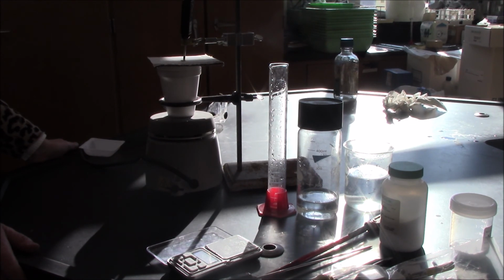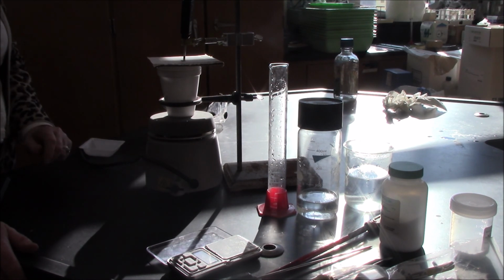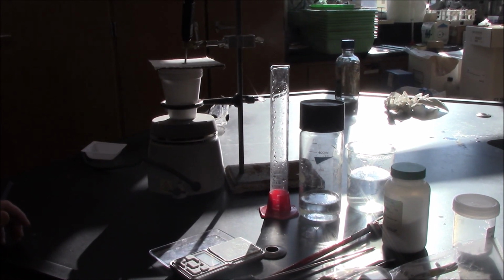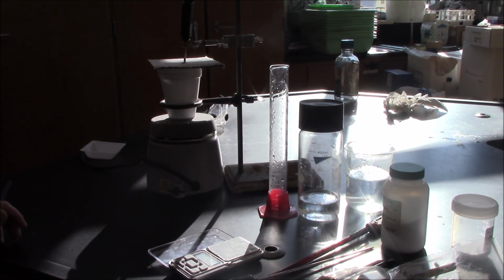The temperature on my thermometer has stopped changing, and the maximum temperature is 27.4 degrees Celsius. I'm going to take a moment now to clean up my materials, and I will be back with the remainder of the data, and I will help to walk you guys through these post-lab calculations.